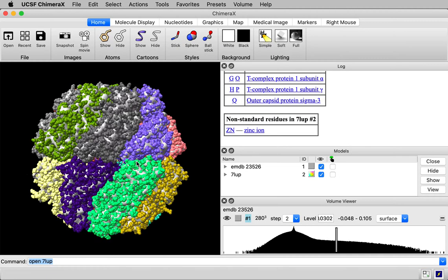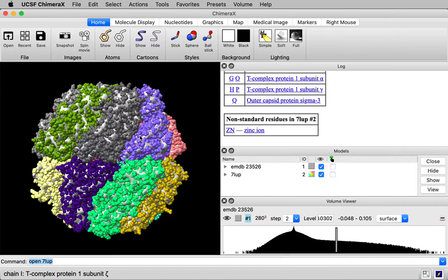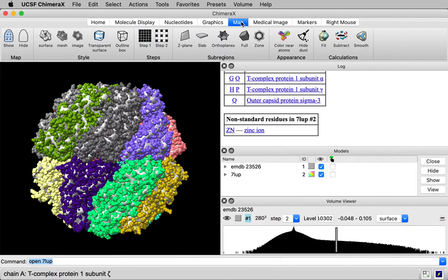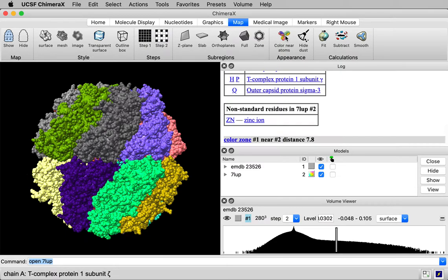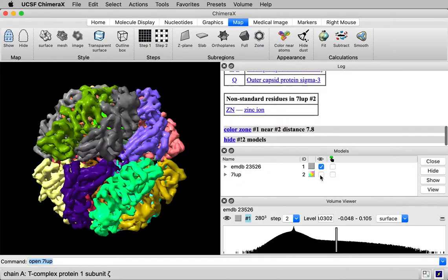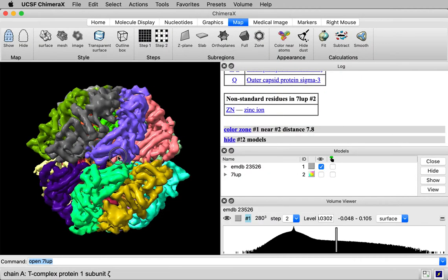And let's color the map using the color of the atoms. So I'll go to the map toolbar. This toolbar icon that says color near atoms, I click on that. If I hide the atomic model now, you'll see the map has been colored to match.